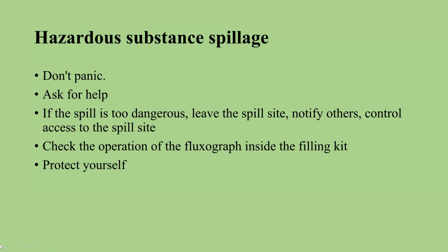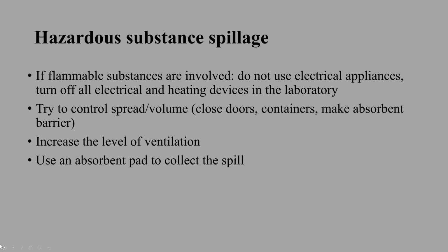Protect yourself first, and the spill site should be protected from access or kept under control.